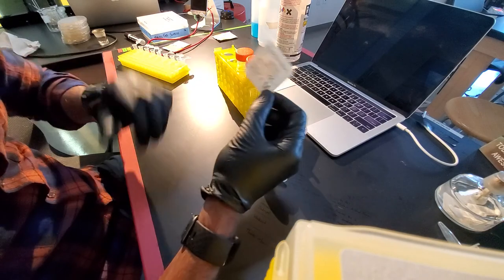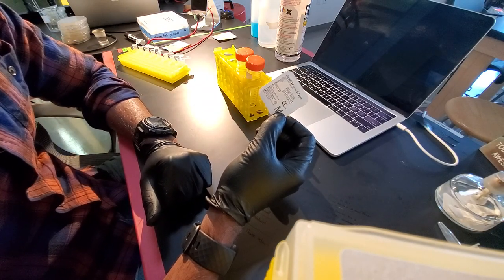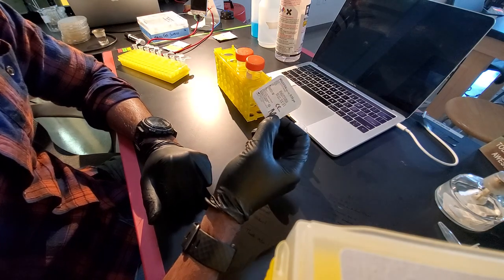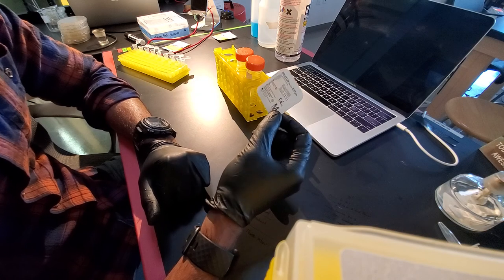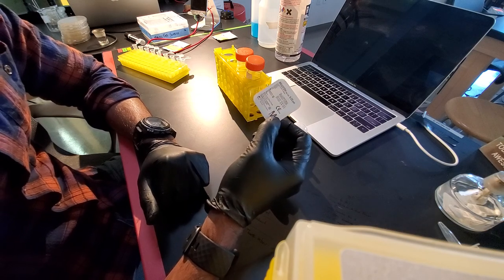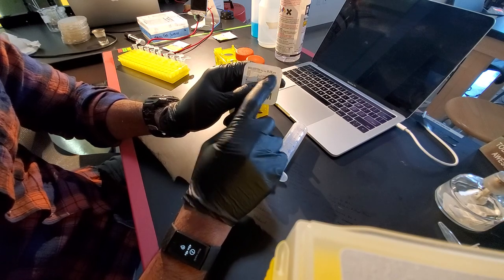And then the selection of the filter is probably the most important part of this whole thing. And what you're going to want to make sure is that you need to know what you're trying to filter out. So in this situation, I'm trying to filter out bacteria, which is generally around one micron. So I'm using a 0.22 micron filter. So you can see 0.22 micrometer filter.